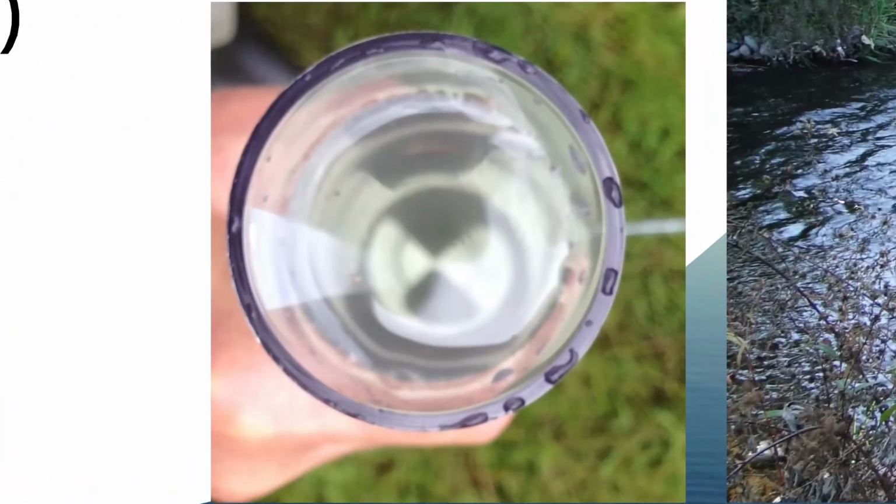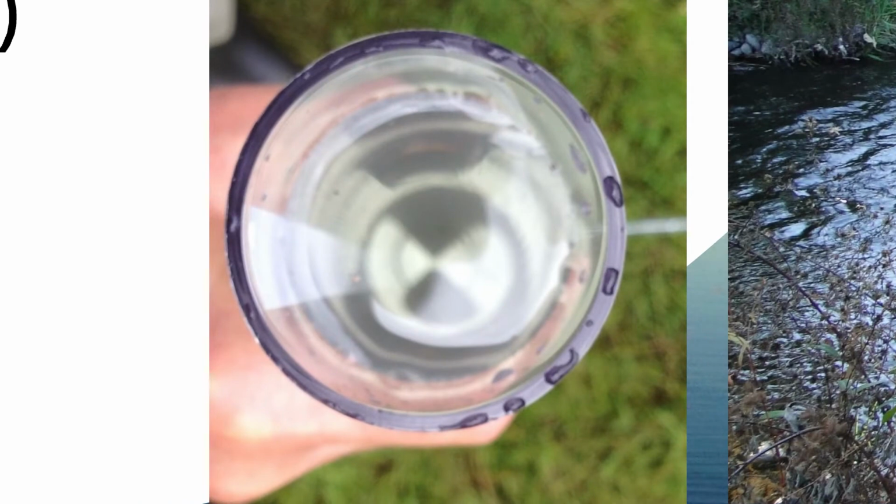Here's what it looks like when you look down the tube. You carefully fill the tube with creek water and then look down through the column of water down the tube to see if the Secchi pattern is visible. Even if it is only barely visible, then your measurement is 60 centimeters or greater.